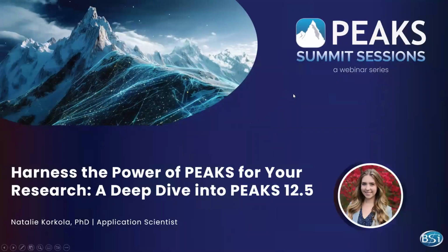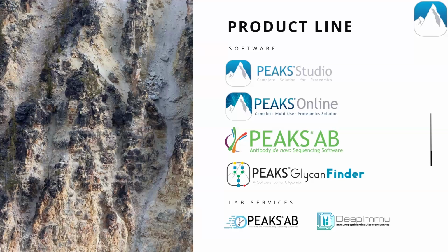All right, so to start, for those of you who may not be familiar with BSI products, we offer a full software suite for proteomic solutions, antibody sequencing, and glycoproteomics, as well as lab services. For this particular webinar, I'm going to be focusing on Peaks Studio, which is our complete solution for bottom-up proteomics.